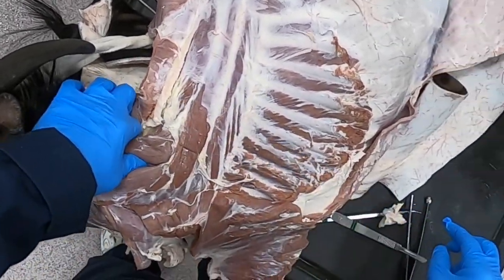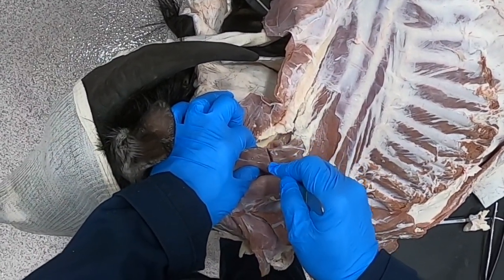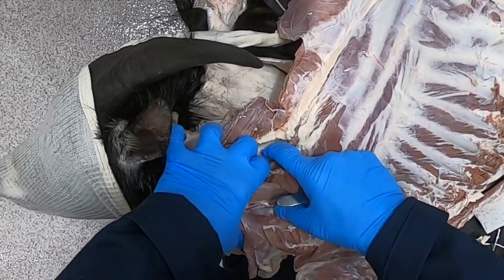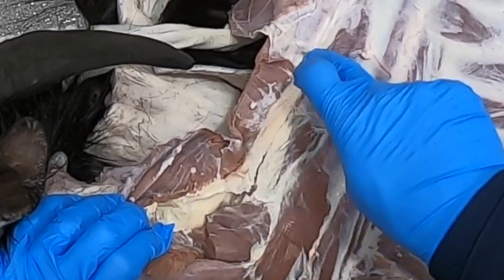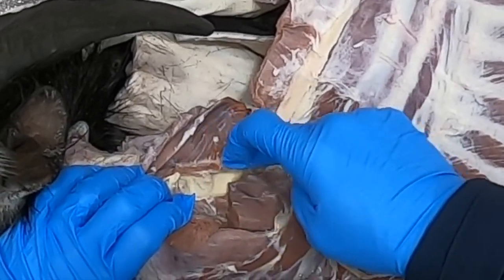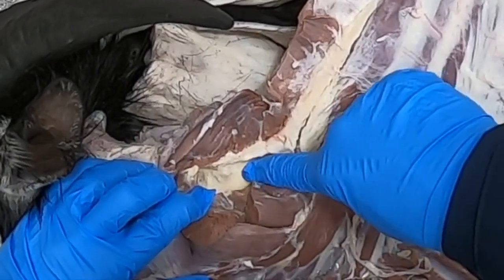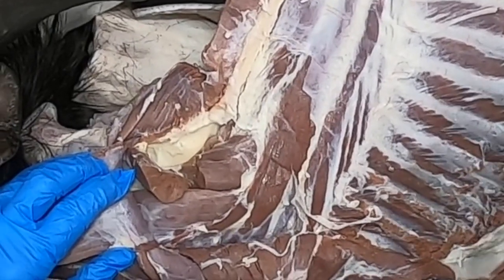I reflected the splenius muscle, which better exposed our iliocostalis system, our longissimus system, and our transversospinalis system. I'm going to cut this semispinalis capitis to give us a nice view of our nuchal ligament. This portion here, continuous with the supraspinous ligament, is the funicular portion of the nuchal ligament, and down here is the laminar portion of the nuchal ligament.